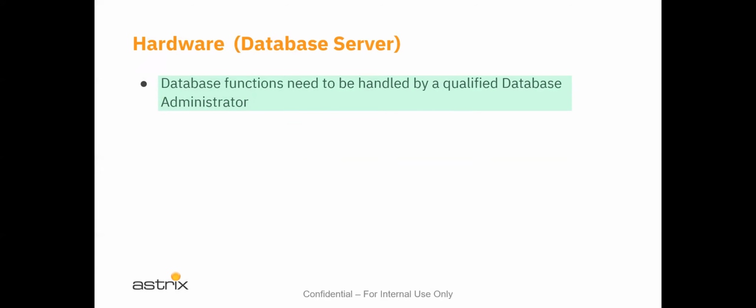So the good news is typically anything related to the database, you're going to be coordinating very closely with a database administrator, and that's typically somebody, of course, hired by the client that manages their database systems. Alternatively, you would be dealing with someone at STARLIMS in the cloud instance hosting environment.